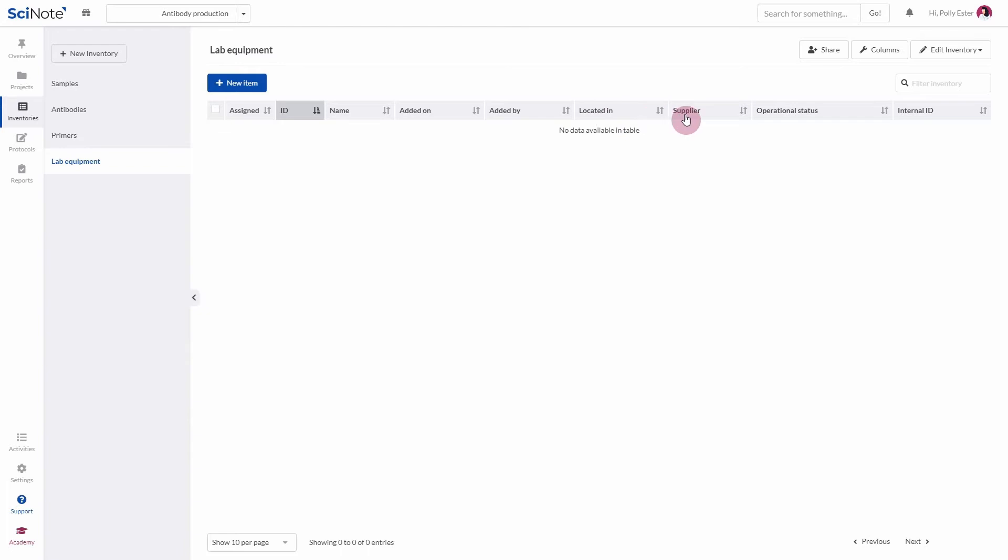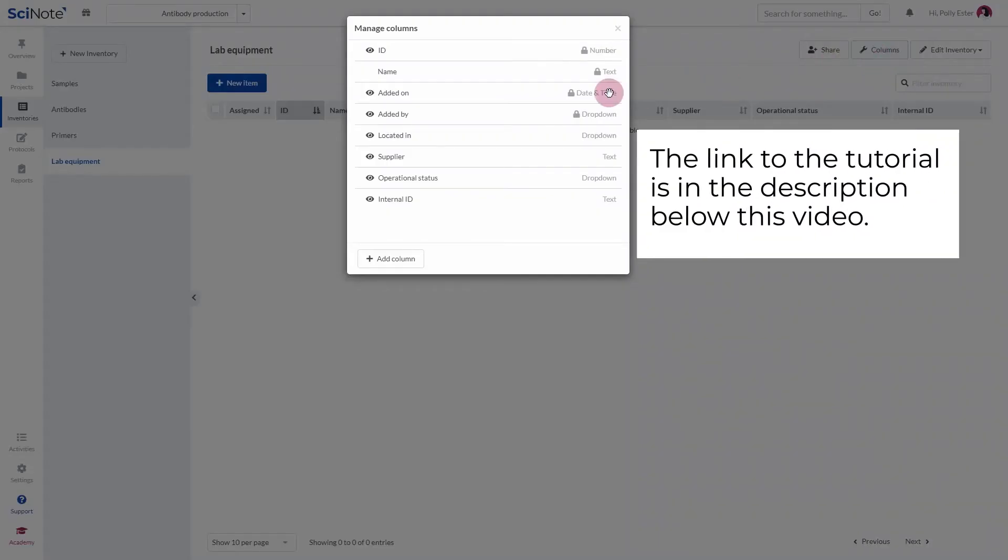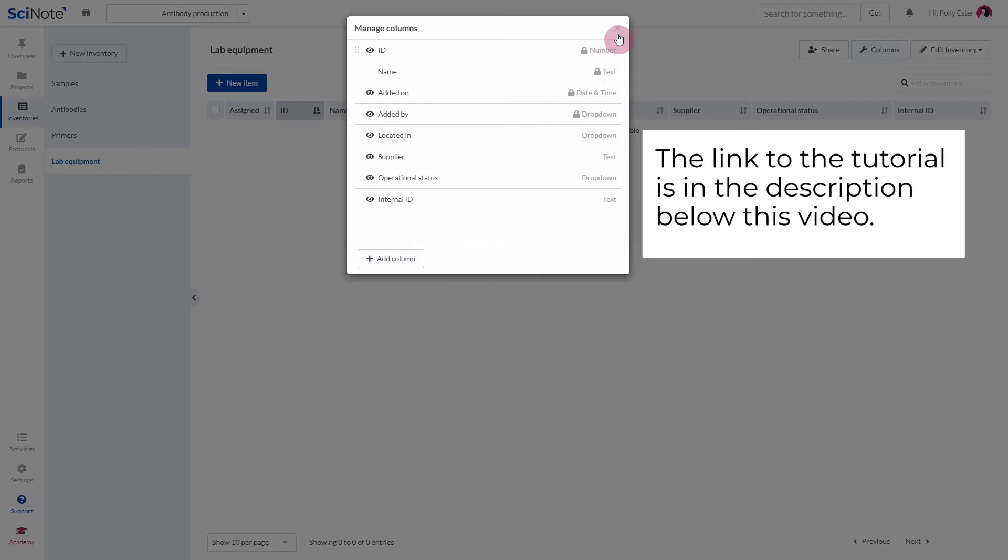If you need to create new columns, you can learn how to do this by watching our video tutorial on how to create new inventory columns.